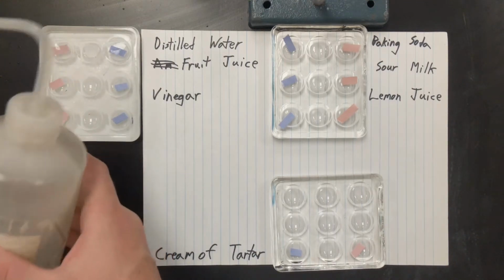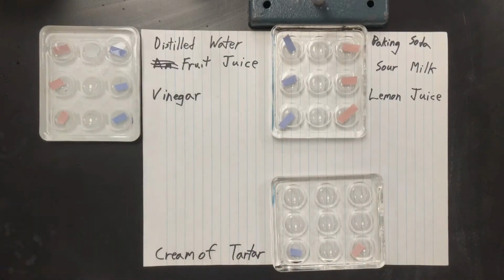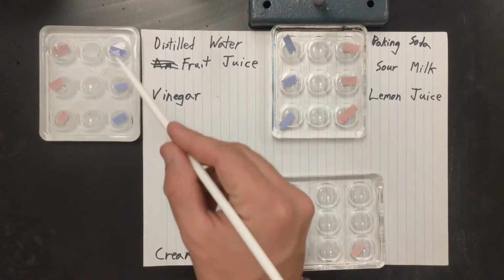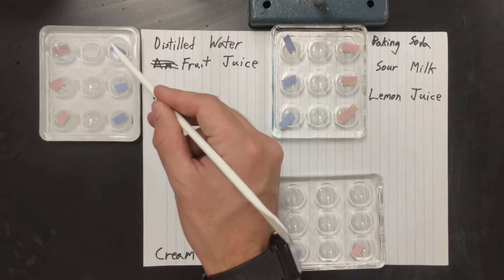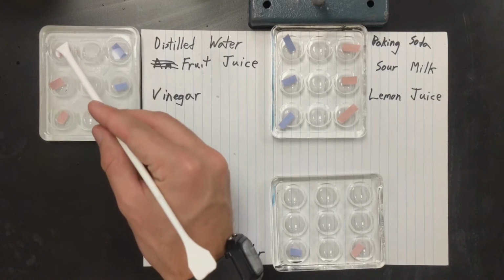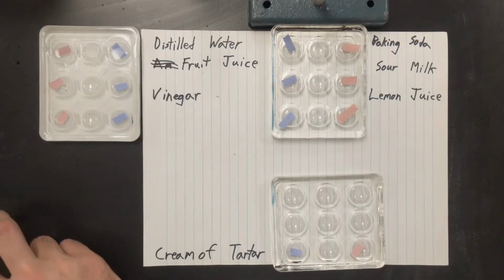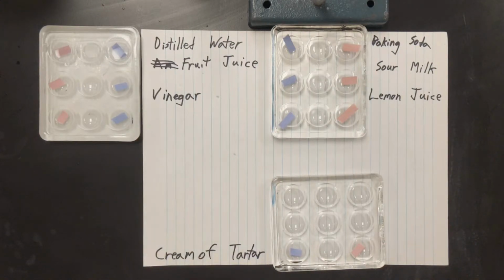It's hard to just get a couple drops. Ideally, you're getting about 2 drops. But you can see that both are wet. And distilled water is also what we clean with, so we can use it with our stir rod, so there's no big deal there. But you can see that they have not changed color. So now what we need to do is start testing the rest.